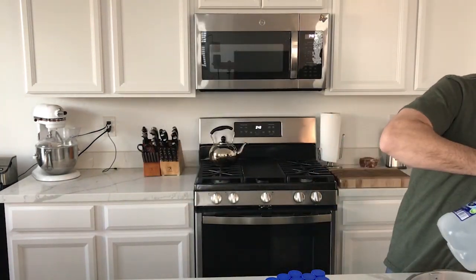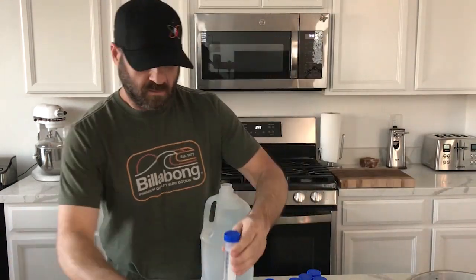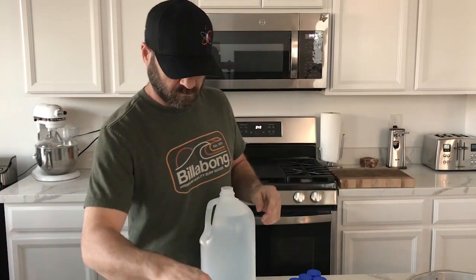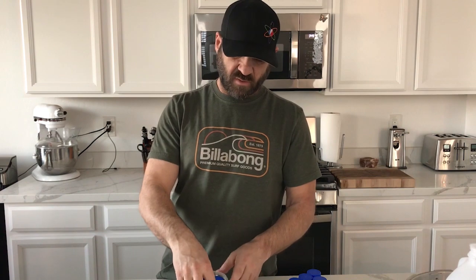Fill each one of these centrifuge tubes up about three quarters full with distilled water, and then put them into a small jar like this. When you put the caps back on the tubes, you don't want to screw them all the way down. Leave them a little bit loose so you can have a little bit of air exchange in there. You don't want to trap off all the air while it's going through the pressure cooker. We're going to pressure cook these for 30 minutes at 15 PSI.